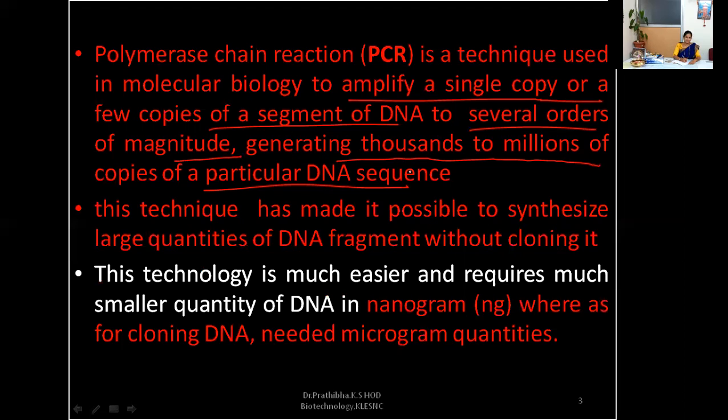This technique has made it possible to synthesize large quantities of DNA fragments without cloning it in the cell system. Without cloning in the cell system, nowadays we are able to produce many copies.